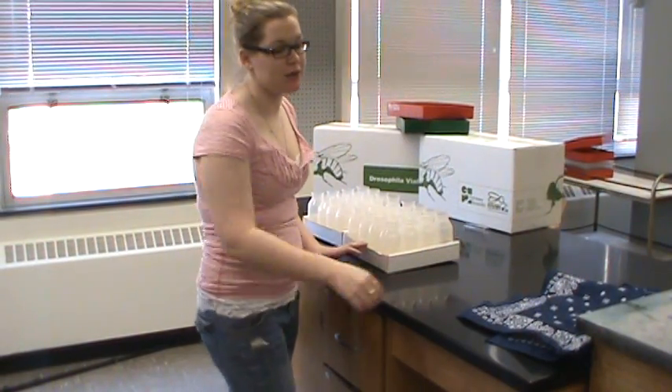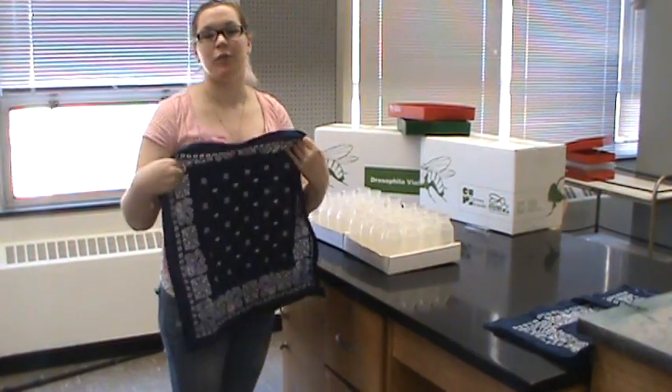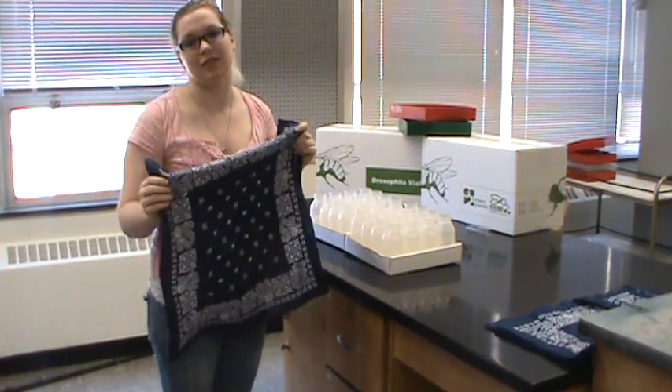These bottles will need to cool for at least five hours. You'll want to cover them with a cotton top, not synthetic, because the synthetic will get slimy.